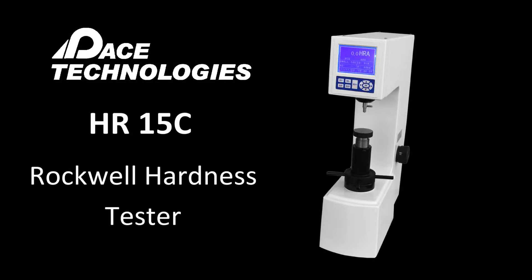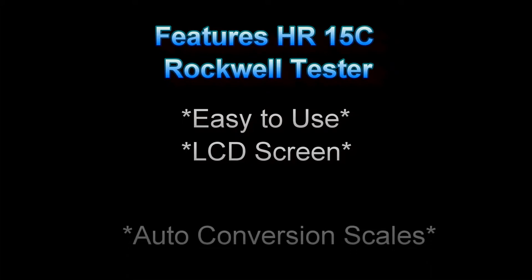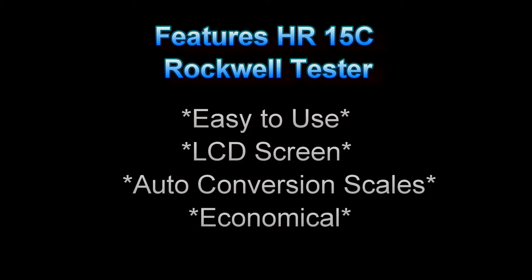The HR15C Rockwell Tester. This unit is easy to use, has an LCD screen, has the ability to auto-convert to different scales, and is economical.